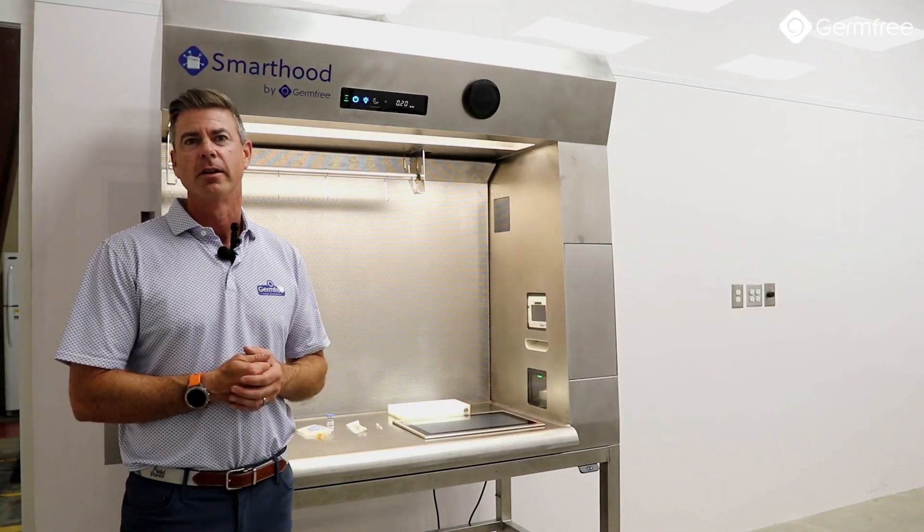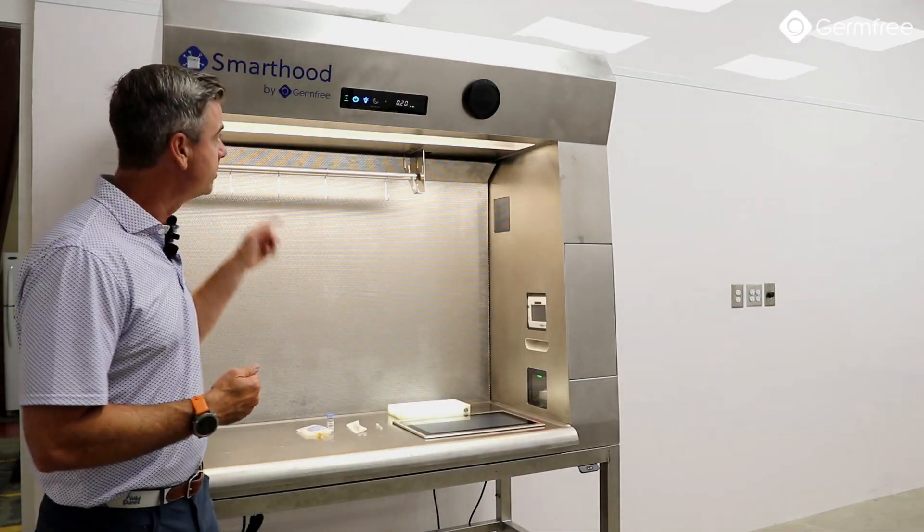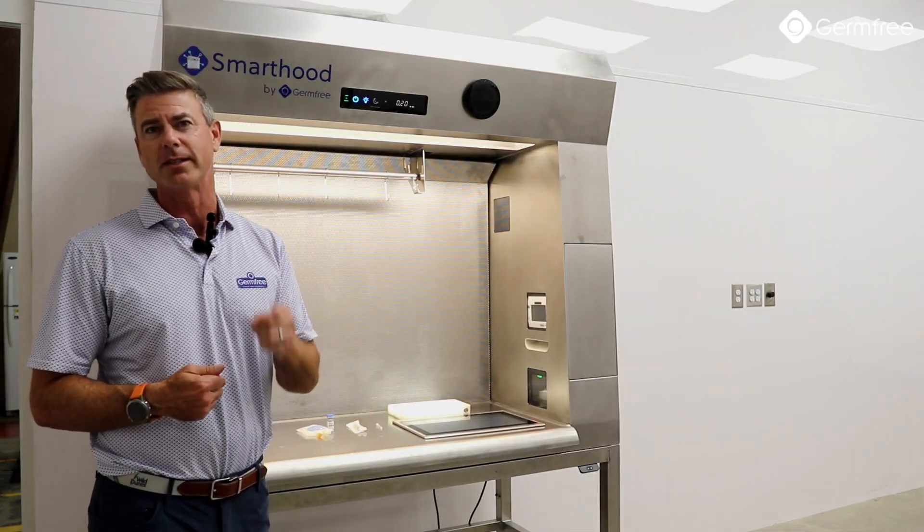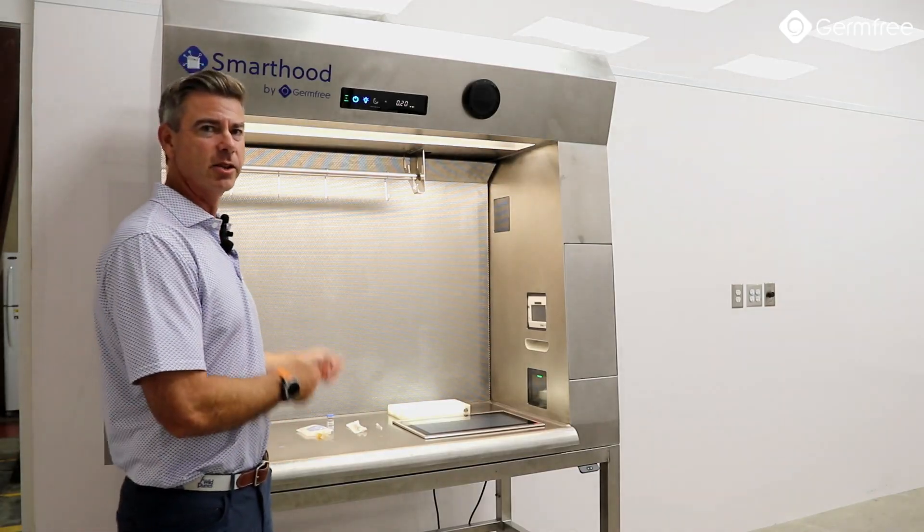What makes it smart? The smart part of SmartHood is the fact that we have built in all the hardware that you need to run your existing IV workflow solutions into the hood.